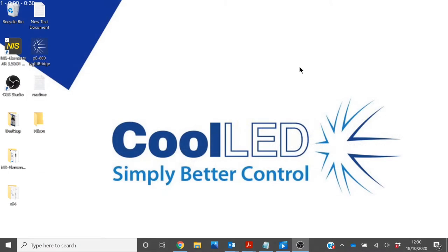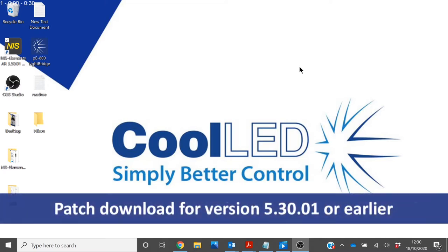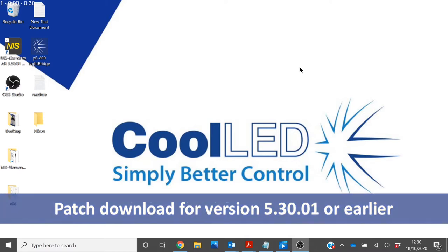First of all, it is important to make sure that you have the correct version of NIS Elements. You will require version 5.30.01 or later. If you are using version 5.30.01, then you must download a patch from the CoolED website. Any later versions will not require this patch.